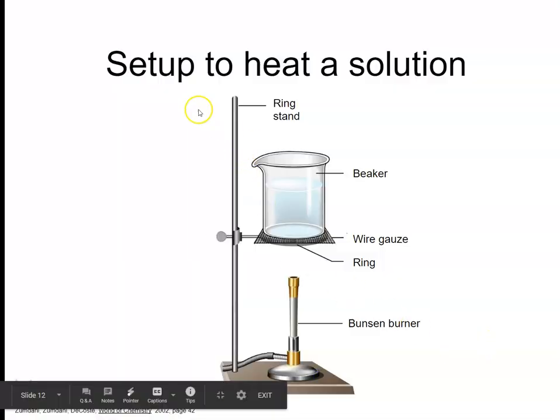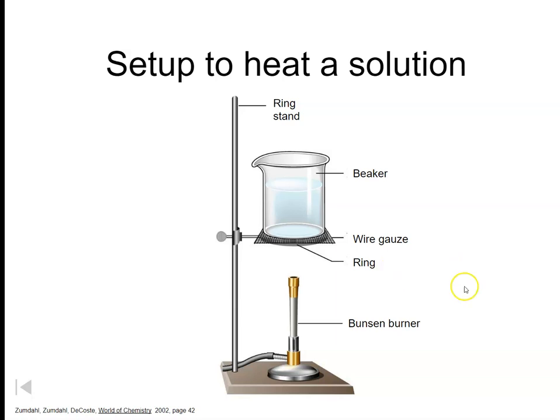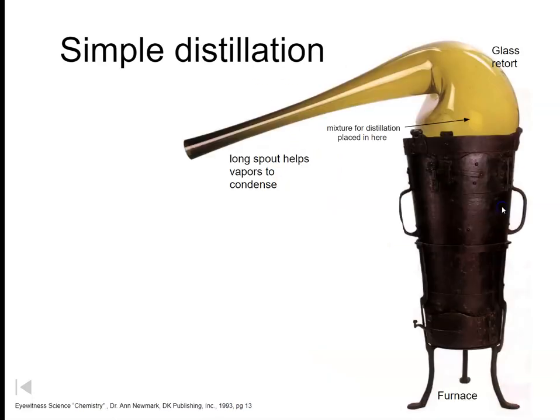So again, if we were to do this, we would need to heat up our solution, but we need something to collect it.